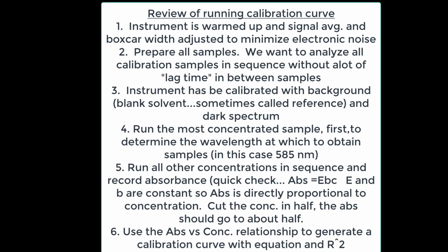So even if it's not a maximum peak, as long as it's the top of the curve, the top of the mountain, it's going to be flat, and that's a reliable spot. In our case, we ran it at 585 nanometers. Now you're going to run all the other concentrations in sequence and record the absorbance.